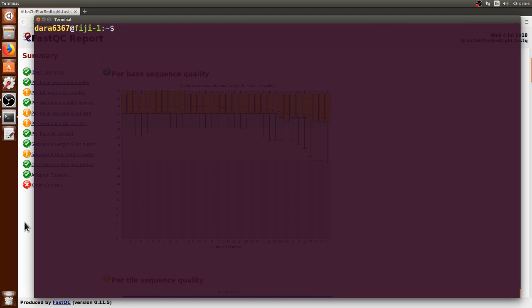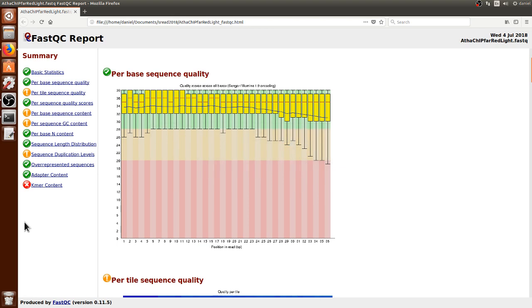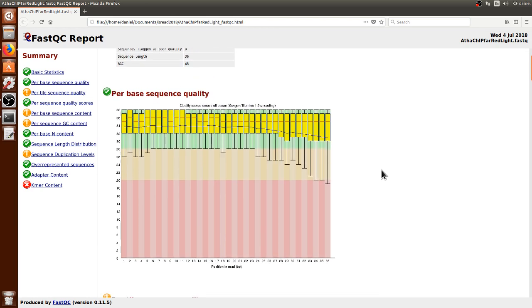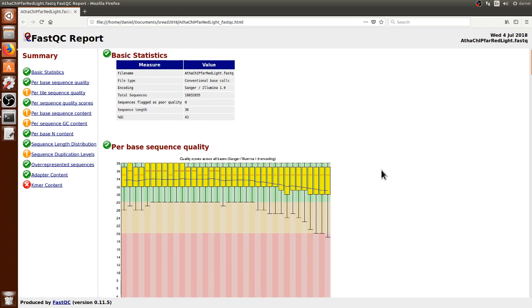In the previous video using FastQC, we saw the quality control, as I put it through FastQC, of this FASTQ file.